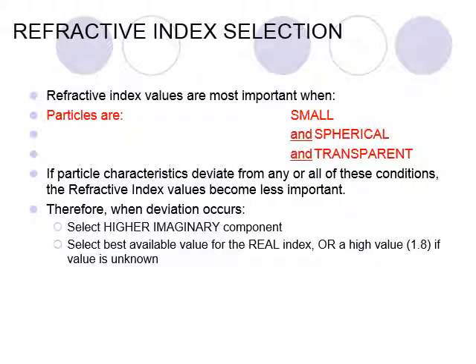When your particles are large, or darker particles, especially not small, then your refractive index values don't matter. You have to put work in to understand your index values when you really need highly accurate measurements of small things.